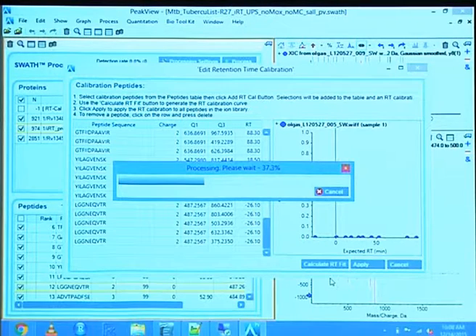Yes. Is this calibrating the retention time? Yes. So what it does right now, that's a good question, is it takes each of these assays and extracts it over the entire chromatogram. It doesn't use as sophisticated a scoring system as it will afterwards. So that's why there are sometimes some issues, and that's why you need to look at it later. It's also faster if you only do 2 or 1, or you don't have a 3-hour gradient. Are there questions so far?